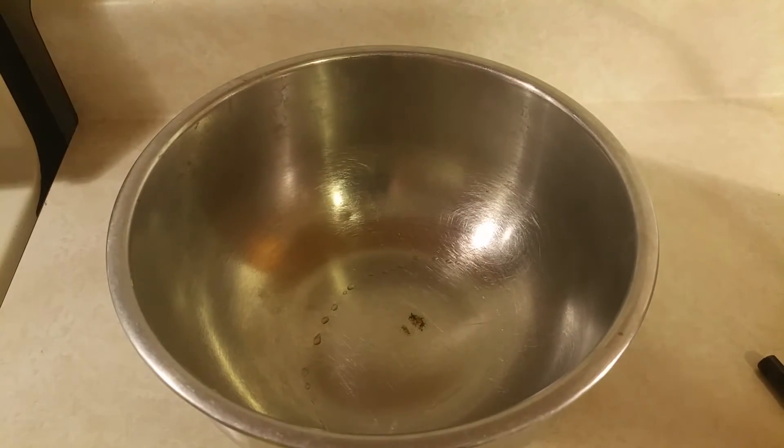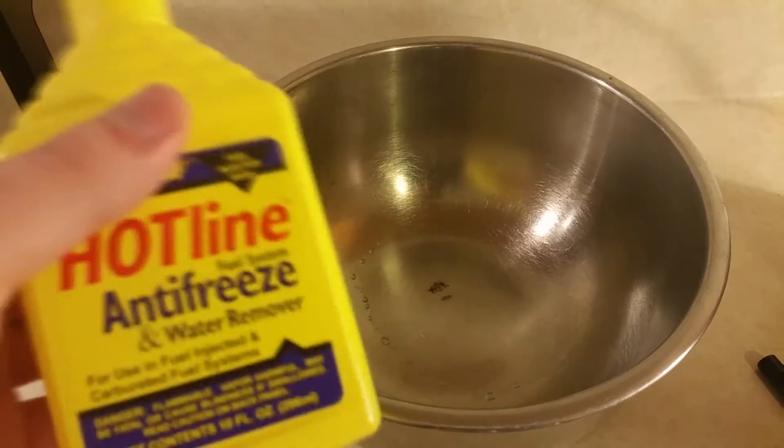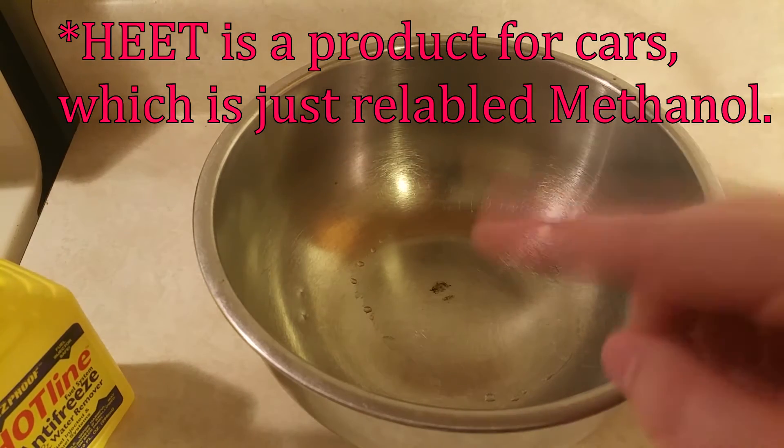Green fire, in my case, is going to be made of tri-methyl borate. We're going to need to produce this on a small scale. To do this, you're going to need heat. My heat source was from the dollar store because I'm cheap.